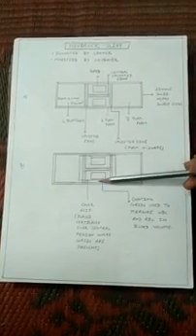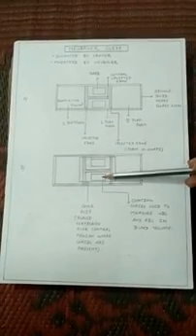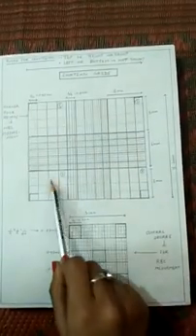So what is the structure of this grid? Friends, let's see the magnified view of this grid. Here you can see the magnified view of the grid. If we assume that this is a big square, then you can see 9 big squares here. It will be first, second, third, fourth, fifth, sixth, seventh, eighth, ninth big squares. So friends, these 9 big squares are used to measure WBCs and RBCs in human blood.